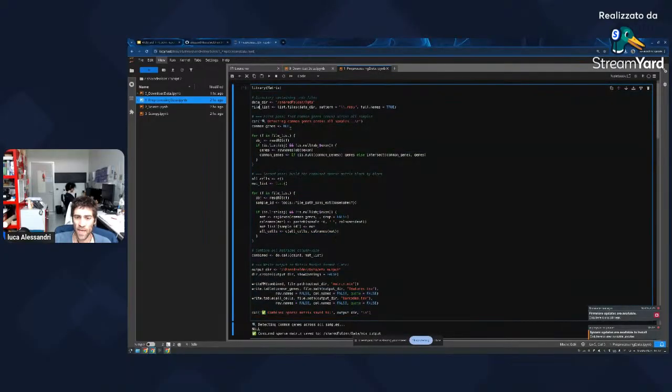So this very first code just needs to take the data and convert it into MTX and TSV and TSV. This is important because RDS, as I said, is a format made by Seurat, a package from the Satija Lab. And Seurat is, I would say, the gold standard so far for preprocessing and clustering algorithms, and also some feature selection.